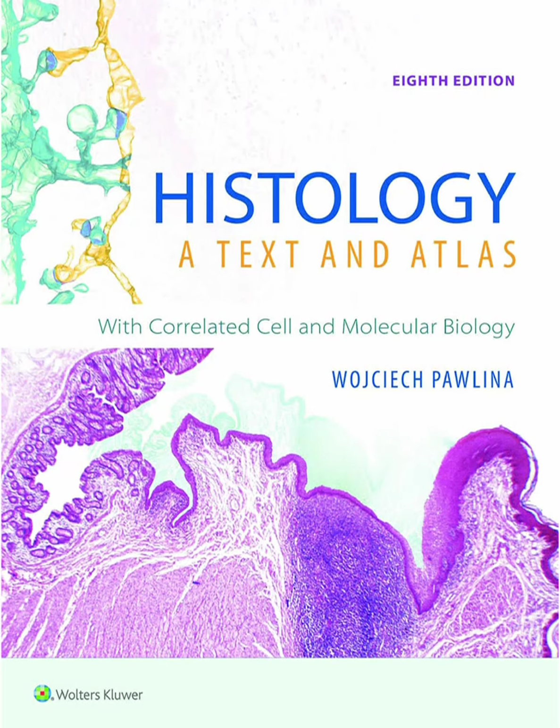It's really the bedrock of diagnosis because it lets pathologists quickly spot abnormalities. The patterns just jump out. So H&E is the bread and butter, the foundation. Gives us that essential overview. But you mentioned it has limitations. It doesn't show everything. That's right, great question.